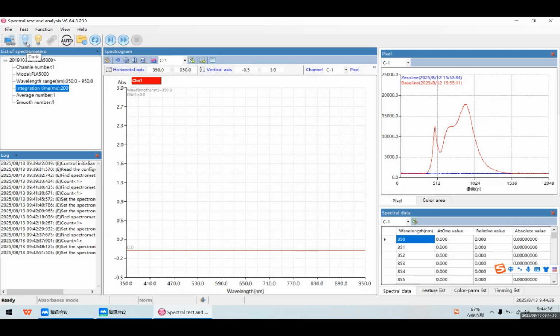Make sure your spectrometer is in a dark environment. In the absence of light, remove the background when the light source is turned off. So let's do it now. Click the Background button. Now turn on the light source.